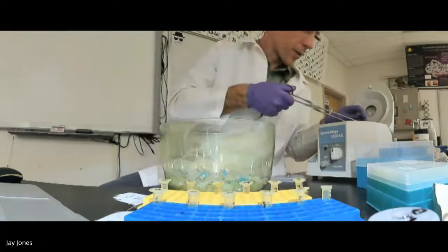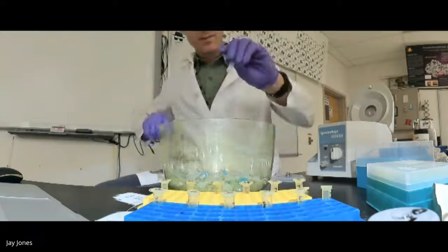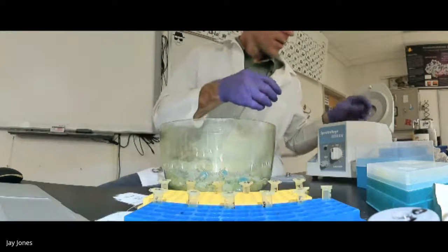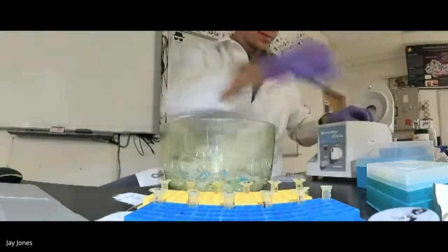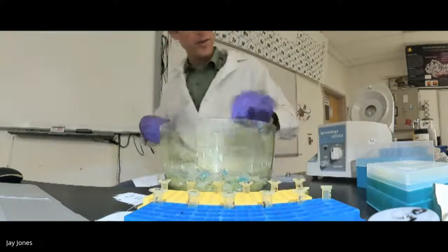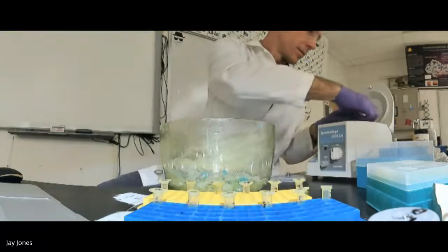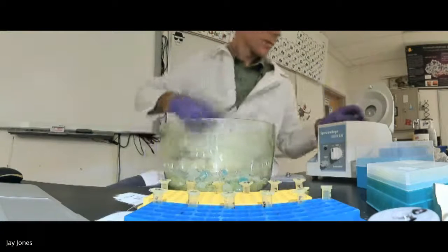Oh my God. You may want to fast forward this part. I'm just pulling out every single tube here and making sure that the ethanol flowed through, because I don't want any ethanol.